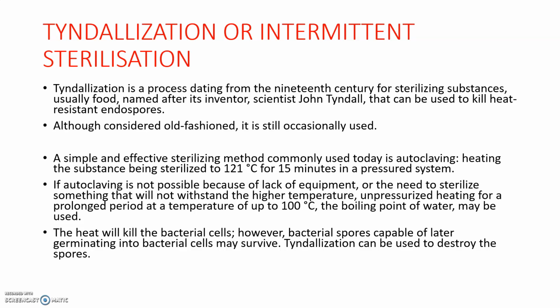Nowadays, however, we commonly use autoclaving, that is, heating the substance to be sterilized at 121 degrees Celsius, above 100 degrees Celsius, for 15 minutes in a pressurized system. Certain materials, when exposed to this temperature, may have their culture media destroyed. In such conditions, we use this method.